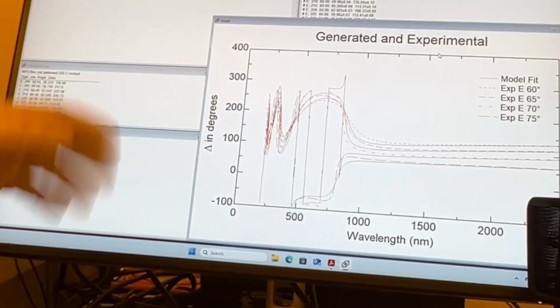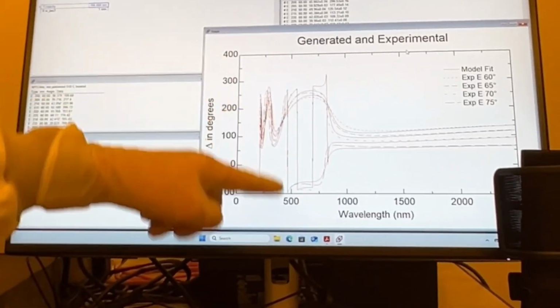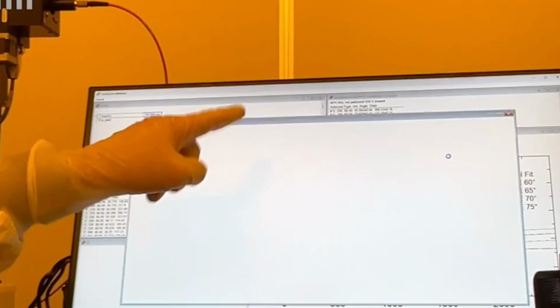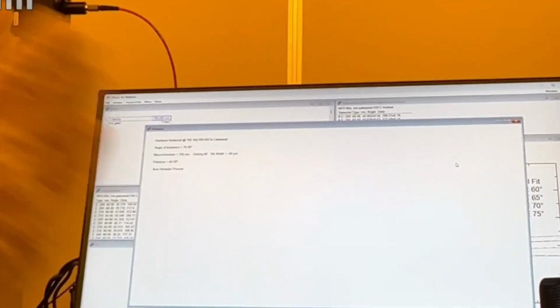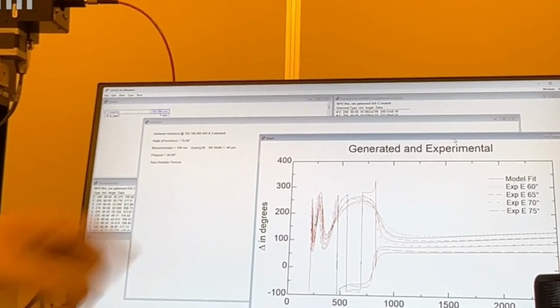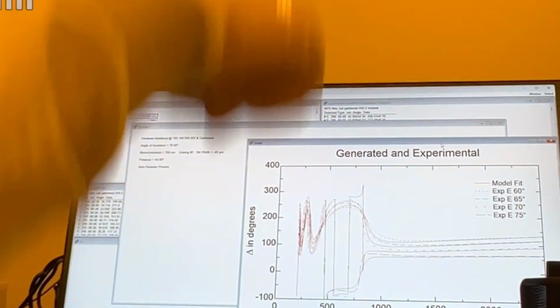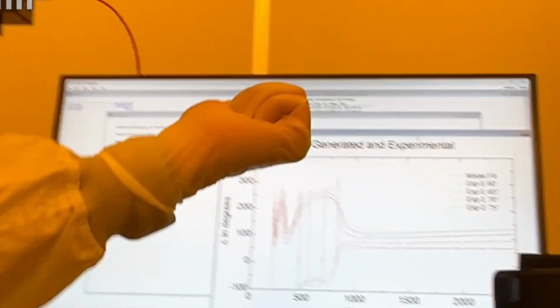Now if we look at delta real quick, just a couple side notes, that phase term. Sometimes it gets brought up, why is delta changing so much right here? Remember I said delta is a phase. Right now, since we use the auto retarder, since it sits for long enough, it'll close the slits. So since we use the auto retarder, I was able to measure delta over a full 360 degree range. So it's like a circle. Every 360 degrees it repeats. You have the wave delay. You got one wave path.